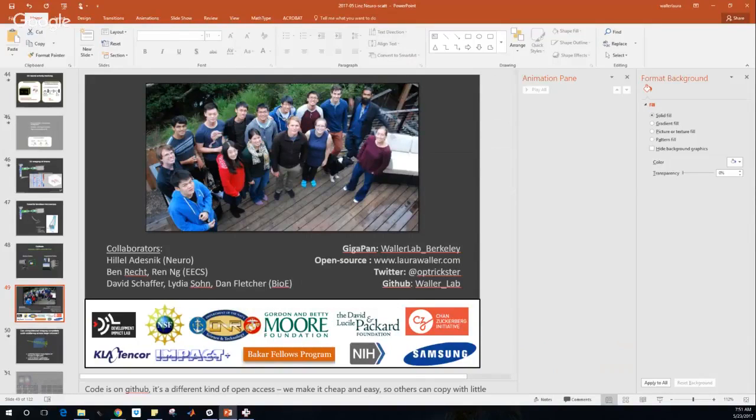Laura, you mentioned lensless imaging a couple of times. What, in your opinion, is at the moment the best lensless imaging option of all the options that we have? Obviously, with lensless imaging, we always have a trade-off between light throughput and depth of field and things like that. You mentioned the DiffuserCam work that you have been working on. There are a couple of other things people use, like coded apertures and FlatCam. What, in your opinion, is the best option for lensless imaging for these applications?